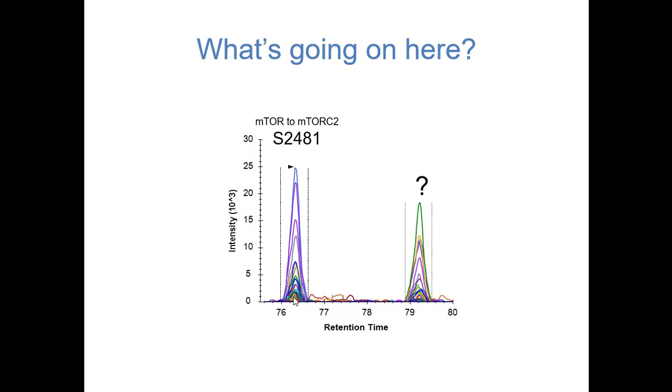So in those cases, you actually get a higher error at the top end when you've got one big fragment ion at the top end than you do otherwise. Does that sort of make sense? Yeah, so you do see things that will sometimes pull in and out of the window. That said, this is actually less of a concern for DIA, I think. Those issues are less of a concern for DIA than they are for DDA.